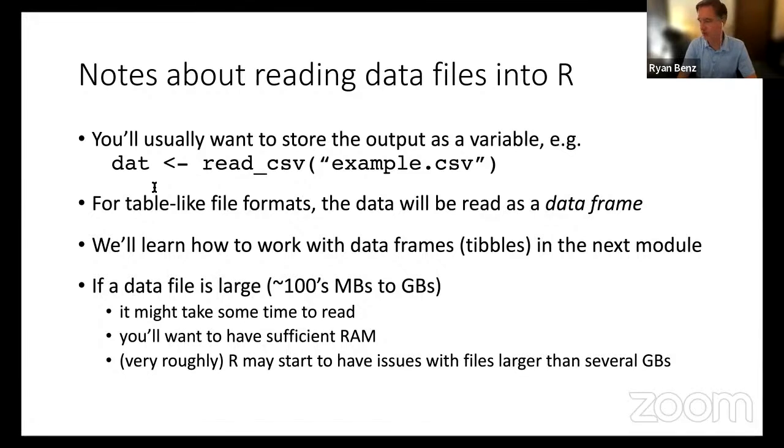The short answer is it may be possible. One way to do it is convert to an MZML and then use another package. There's an mzR package in Bioconductor that can read MZML files. It is definitely more complex. Happy to talk about that in questions at the end, but it does go beyond the scope of what we're covering here.